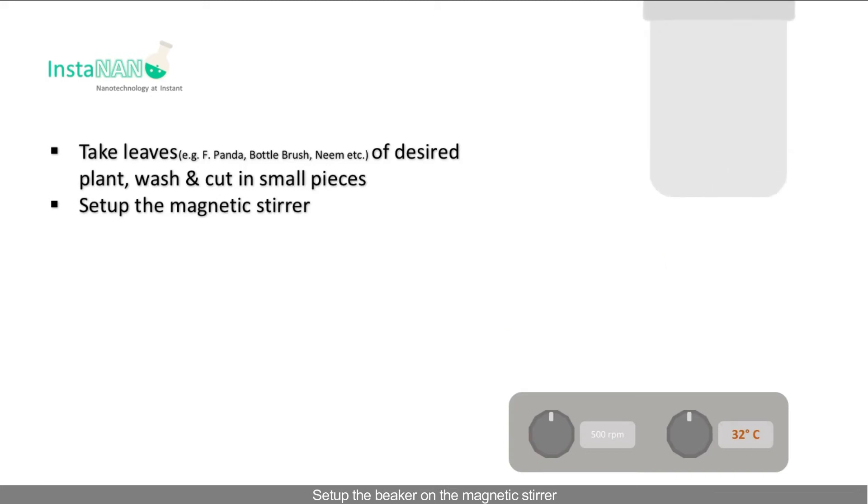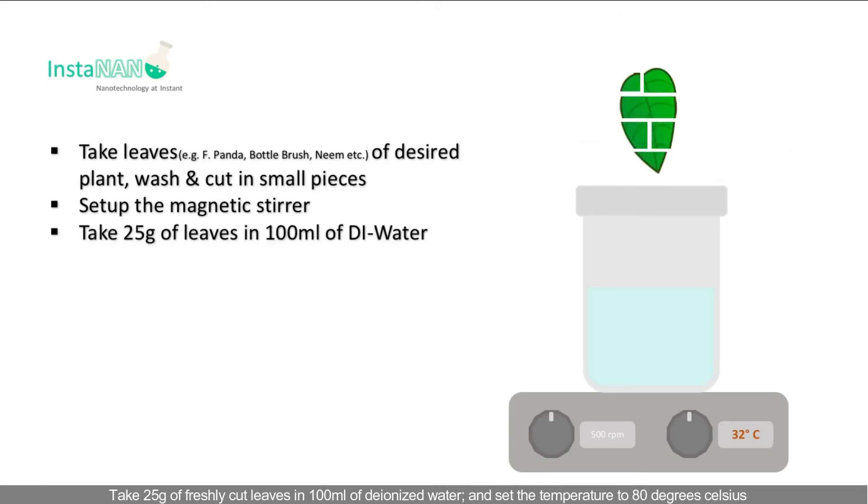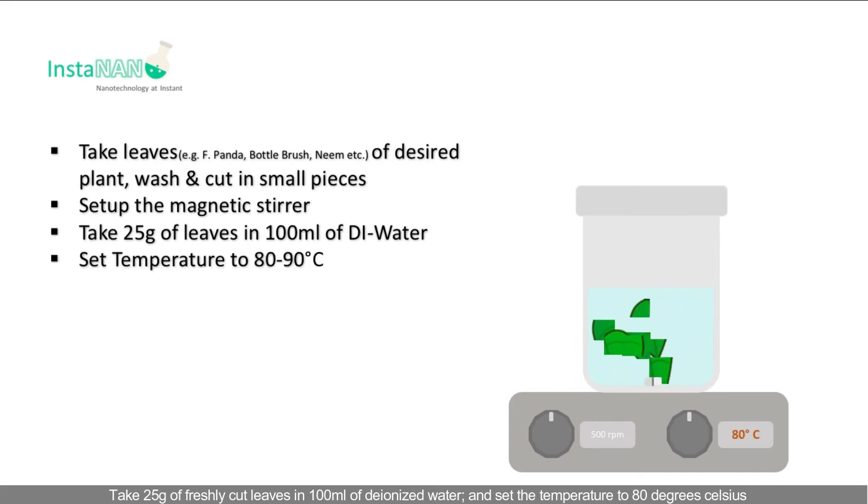Set up the beaker on the magnetic stirrer. Take 25 grams of freshly cut leaves in 100 ml of deionized water and set the temperature to 80 degrees Celsius.